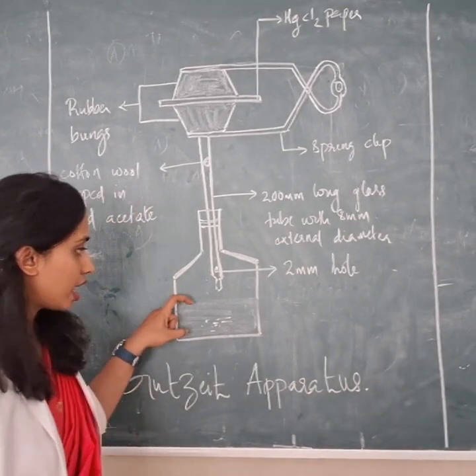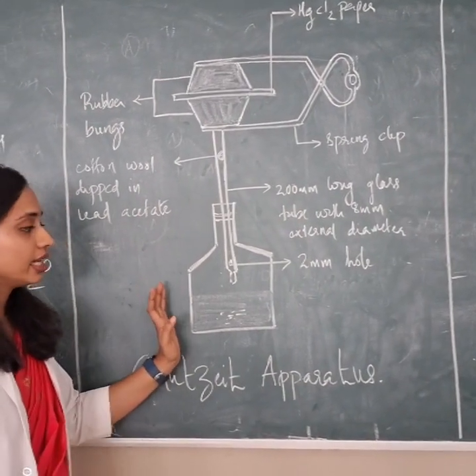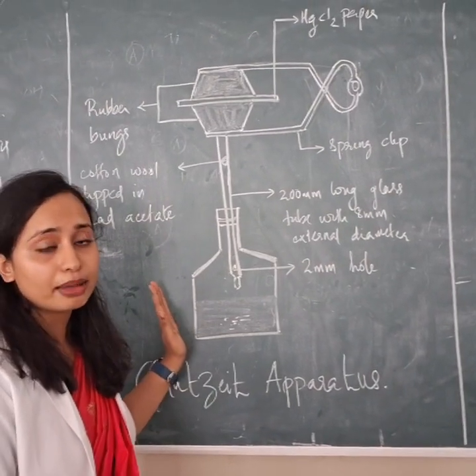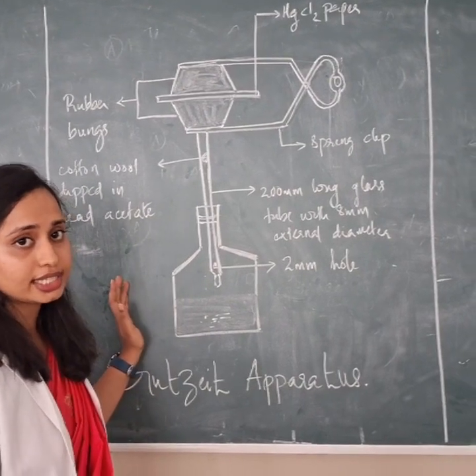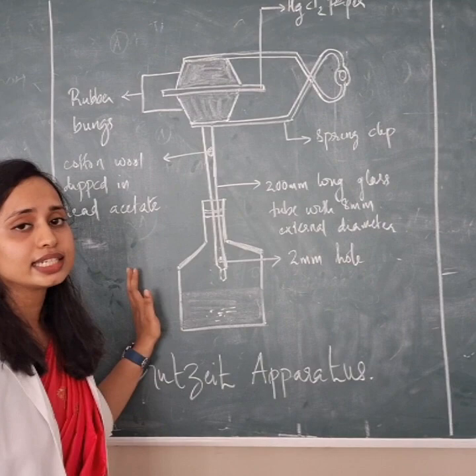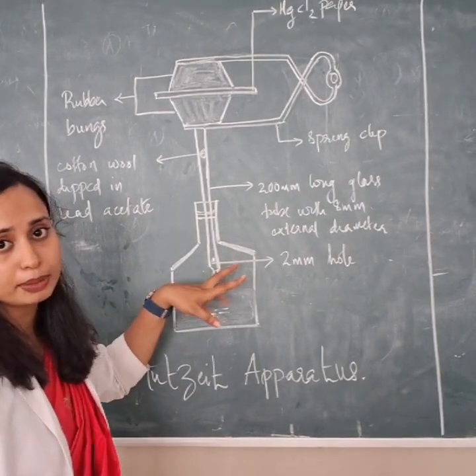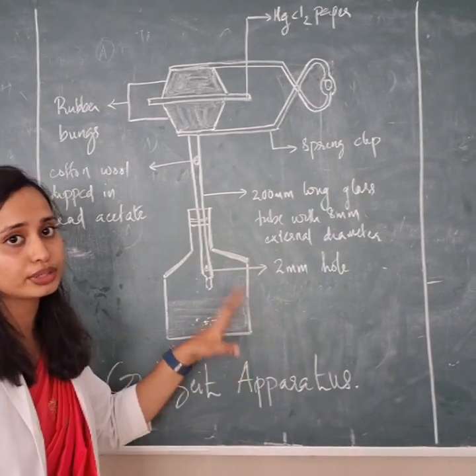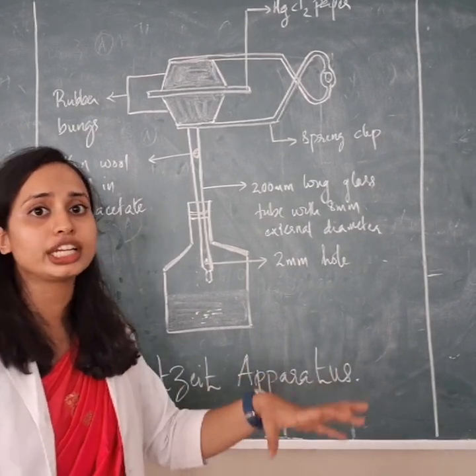So the standard arsenic solution is placed in the glass bottle, and then we are adding 1 gram of potassium iodide, then 10 gram of granulated zinc, as well as 5 ml of stannated acid solution, that is stannated hydrochloric acid solution. Then it will produce the arsine gas. All these contents will react and produce the arsine gas. And this reaction will take about 40 minutes.